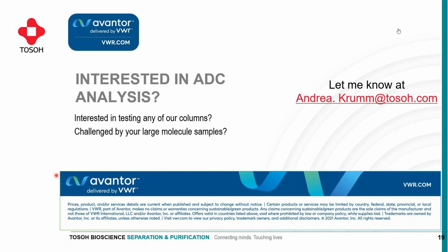For hydrophobic interaction chromatography, there are also 1, 2, 3 publications that show compatibility. However, it is much more tricky to get hydrophobic interaction chromatography together with mass spectrometry, and it's not something that is regularly used, I would say.